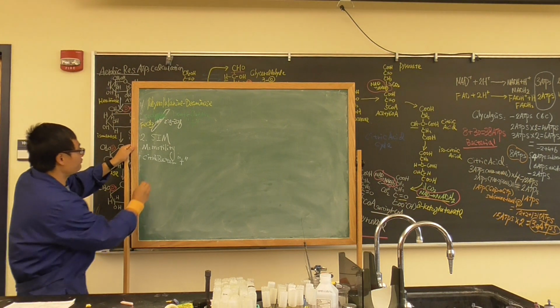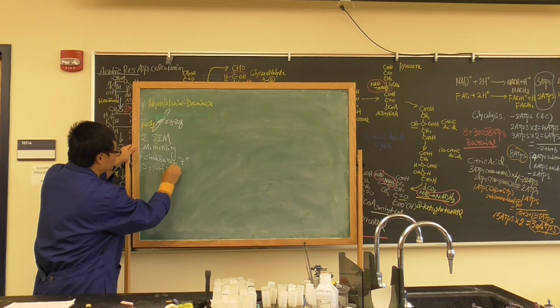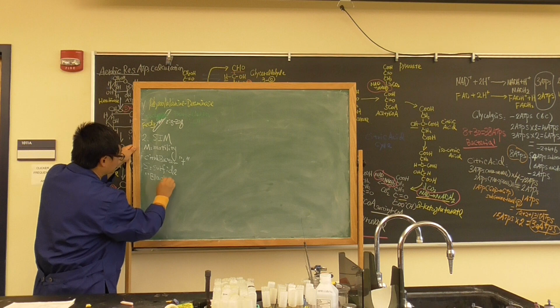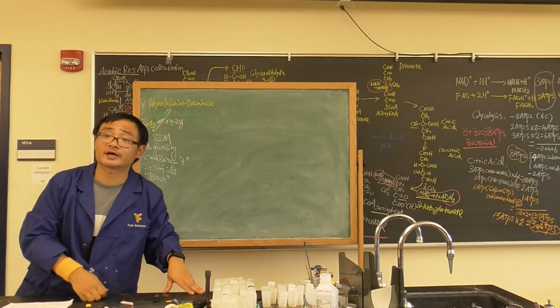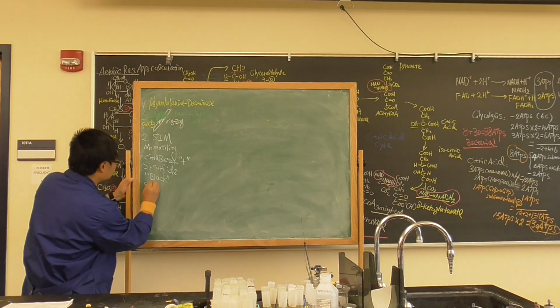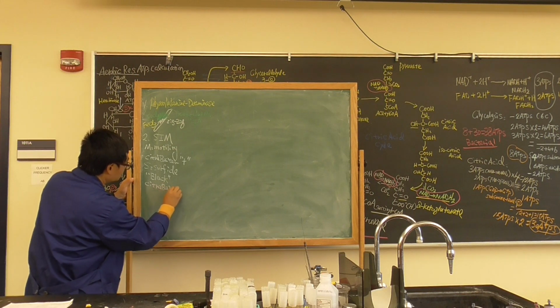And how about sulfide? Which one is positive? If your tube turns black, it is positive. Which one is black? Citrobacter. Citrobacter is black. Others, they're all negative. So you record it. Same thing, Citrobacter is positive.